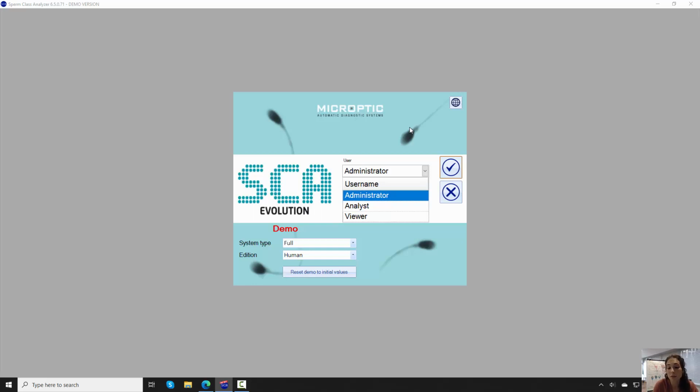This will be different from the analyst, for example, that has just some rights during the analysis process, but there will be some actions not allowed for the analyst. And the last one is the viewer, just able to see the already performed analyses and have the reports.